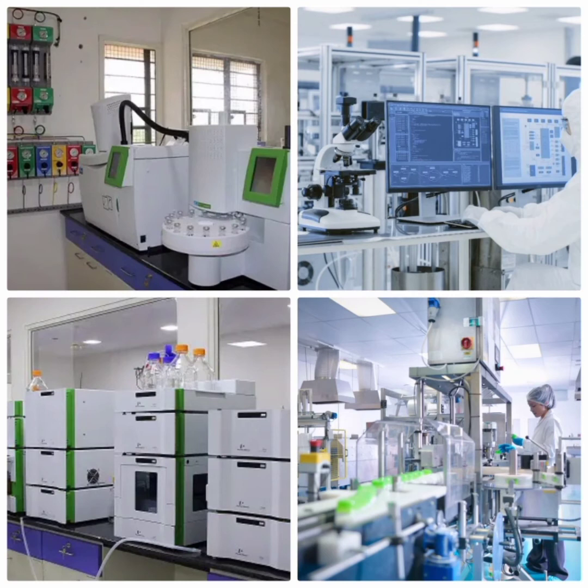For the case of HPLC, you have seen that the sample can be volatile or not, low or higher molecular weight, stable at room temperature, and soluble in liquid phase. For resolution issues, for GC it is similar molecular weight, whereas for HPLC, resolution issues are of similar polarities.